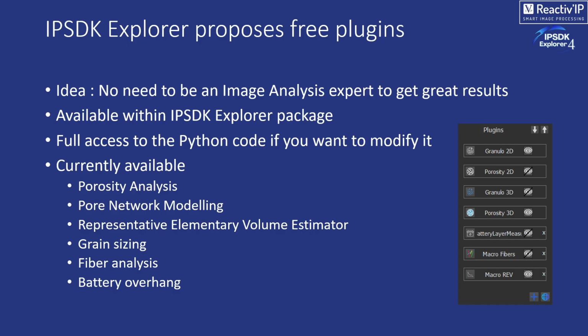And it was said, well, IPSDK is good, but we need to be experts in image processing to be able to use it properly. So that made us decide that we don't oblige you to be an image analysis expert to achieve great results, to achieve great science. So we developed these modules, and we decided that also in terms of money, because that was also one of the complaints, saying, well, we don't want to be obliged to pay every time that we need a module.